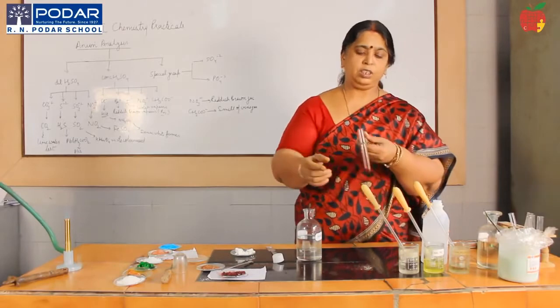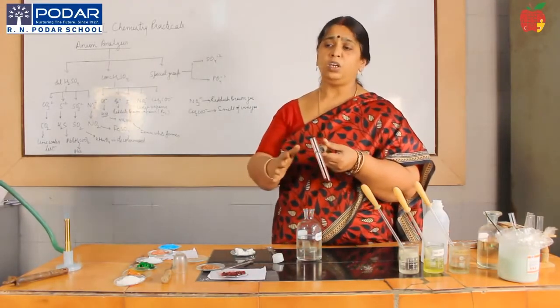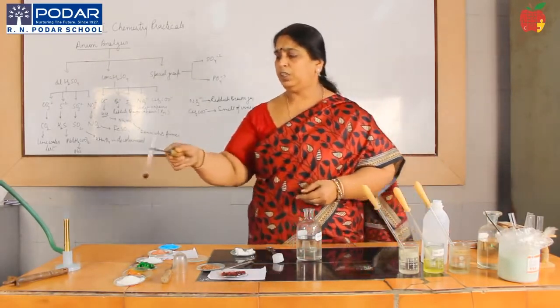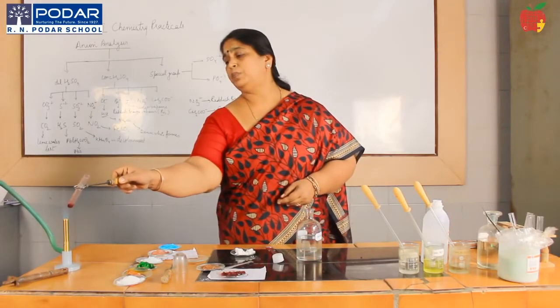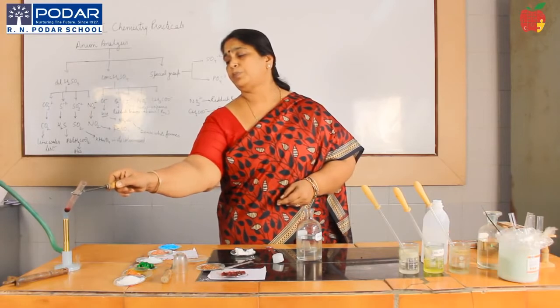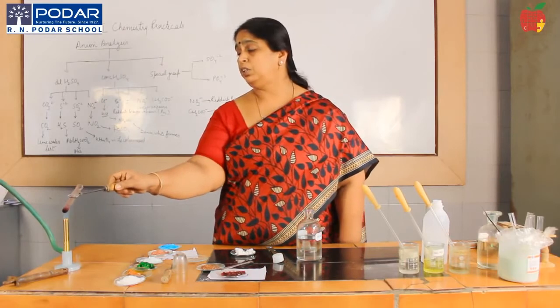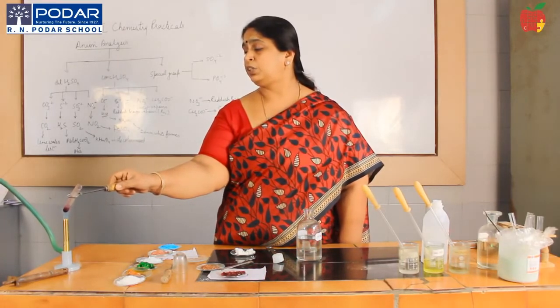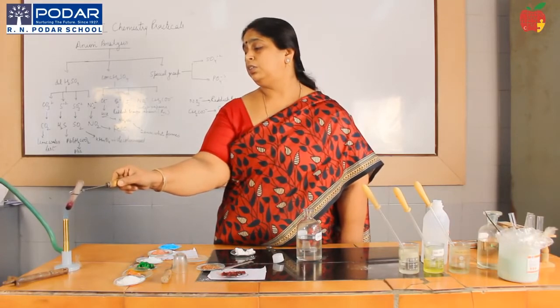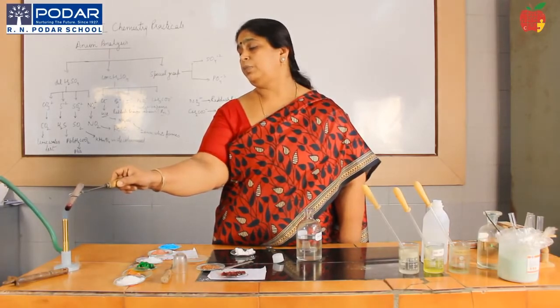Now you see some small fumes are coming out, but as ma'am mentioned, it is not a chloride or anything. So just go for heating of this. Okay, just heat it and you observe what's being observed there. When you heat, please keep the test tube in a slanting position away from your face as well as your friend's face, and you can see that some gas coming out. Can you see the gas coming out?